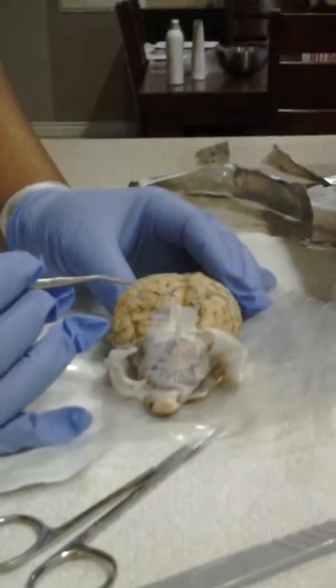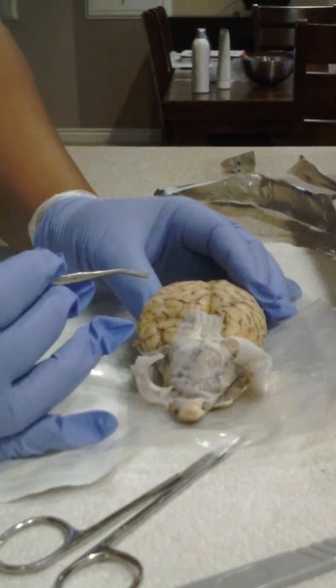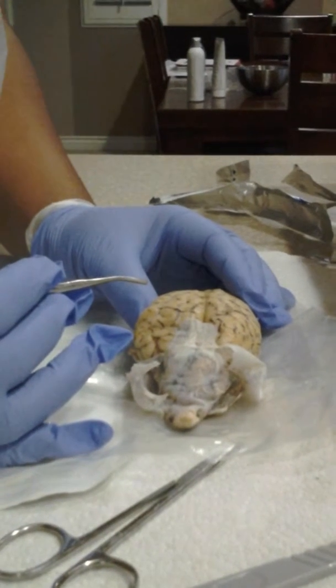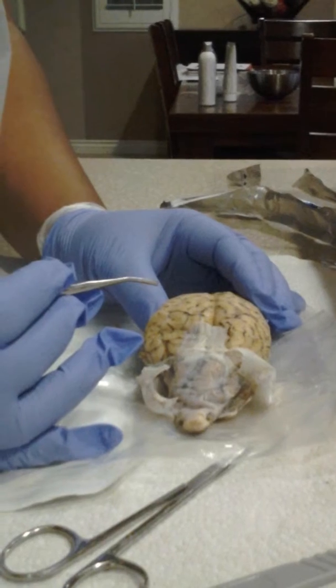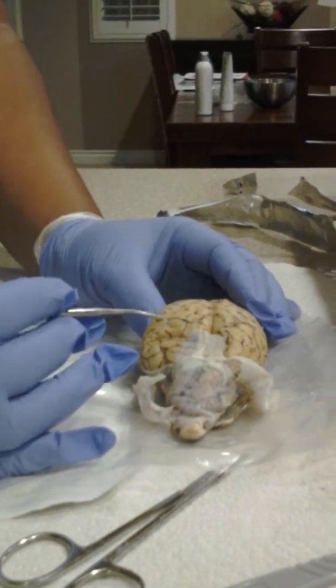Okay, here we have the gyrus, and the gyrus is a ridge on the cerebral cortex. It is generally surrounded by one or more sulci, which are depressions or furrows, and that is what the gyrus is.